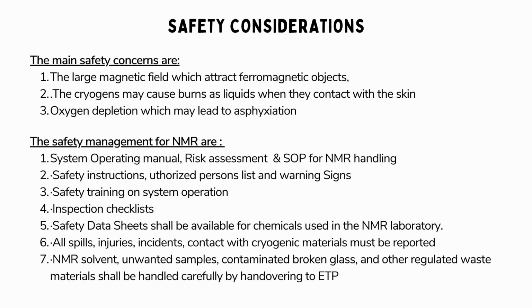The main safety concerns regarding NMR include the presence of a large magnetic field that attracts ferromagnetic objects, the potential for cryogens to cause burns when they come into contact with the skin, the risk of oxygen depletion leading to asphyxiation. To manage safety in NMR, the following measures are recommended. Operating according to the system's manual, conducting risk assessments, and implementing standard operating procedures for NMR handling.